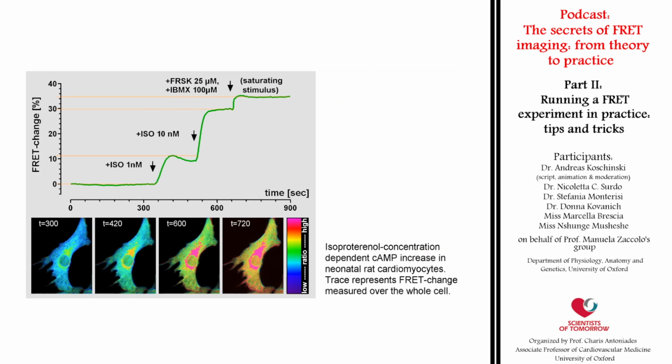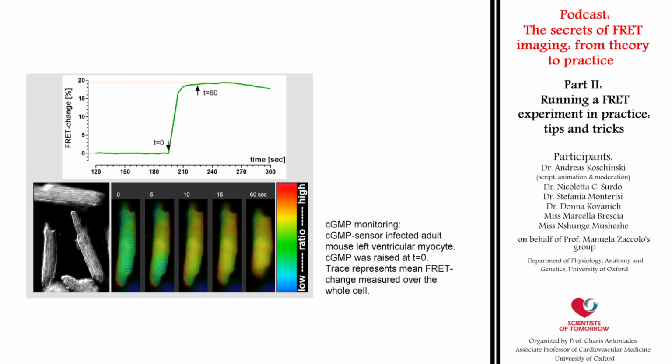In this way we can compare the answers of sensors to different stimuli or inhibitors and draw conclusions about their impact on cAMP levels or regulation, or explore their impact even on a compartmental or macromolecular level by using targeted sensors. To mention only a few, apart from cAMP sensors, there are also FRET sensors for cGMP, PKA activity, calcium, pH or redox monitoring available. All this monitoring can be done in living cells and in real time. This has made FRET imaging a versatile and indispensable tool for the exploration of the multitude of intracellular signaling pathways.